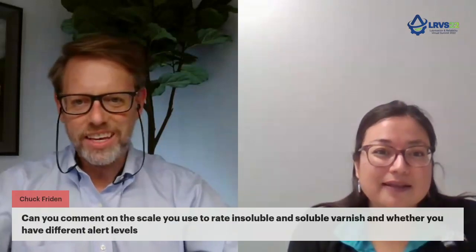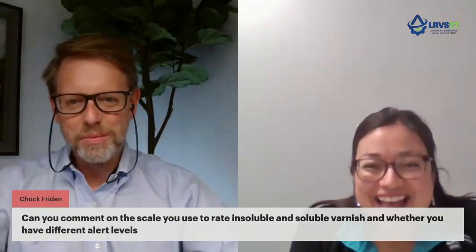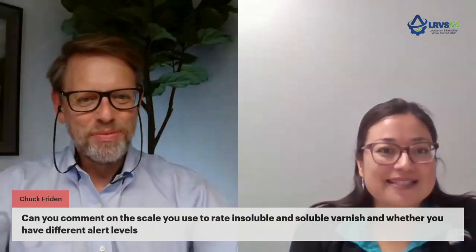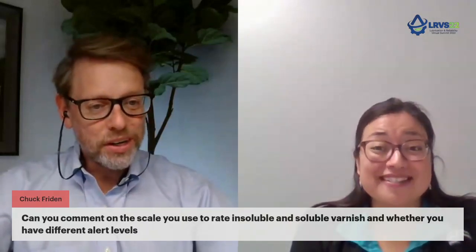Around 45 is a condemning limit, but when you have a value of 30 is when we begin to caution. Okay, excellent. I think Chuck actually had a very similar question about the rating scale of soluble versus insoluble. So we have time for one more question here.